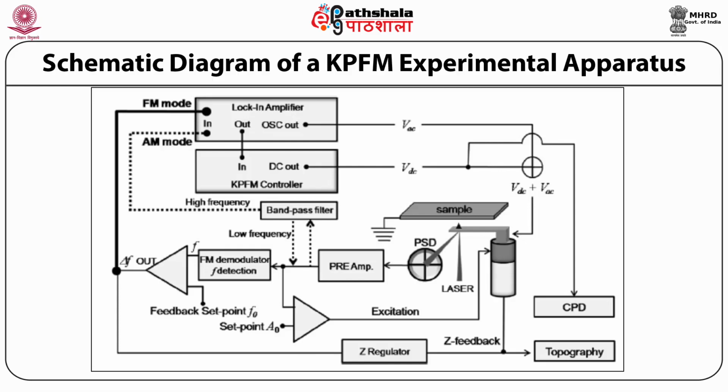KPFM characterization of the electrical property of metallic nanostructure is described. KPFM has enabled the experimental determination of quantum size effect on the electronic property of metallic nanostructure. Point 2. KPFM has been used to study the electronic property of semiconductor nanostructures and surface.